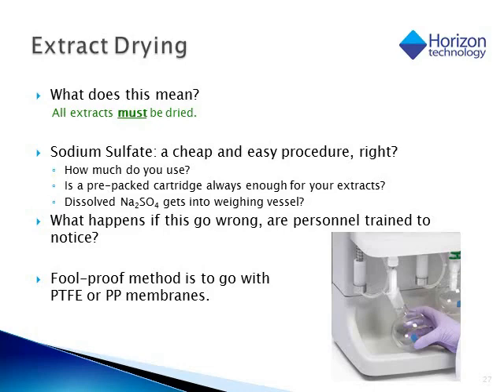You may be using pre-packed cartridges that don't have enough sodium sulfate in them, and you may have water pass through. You may not seat your filter paper correctly, and the fines will get through. Or you may not rinse it well enough at the end of the process, so you might lose recovery. All of these things point towards sodium sulfate being easy to have a problem with. The truly easy way to dry your extracts is to use a membrane to physically separate rather than to chemically separate the water from the extract.